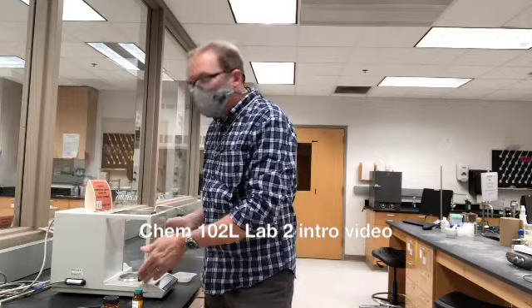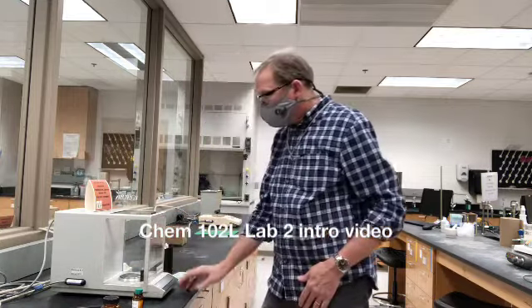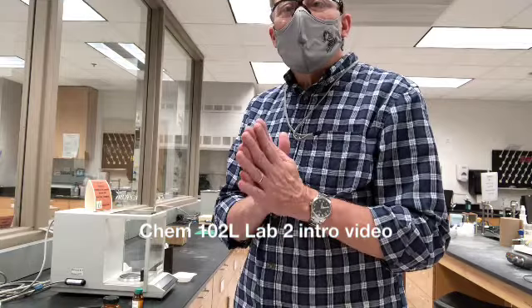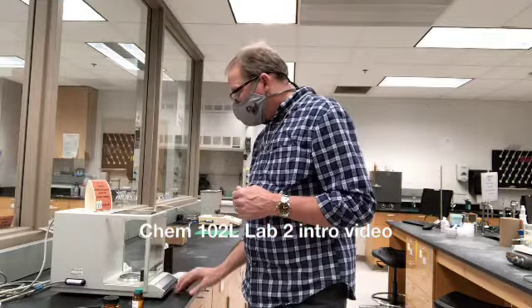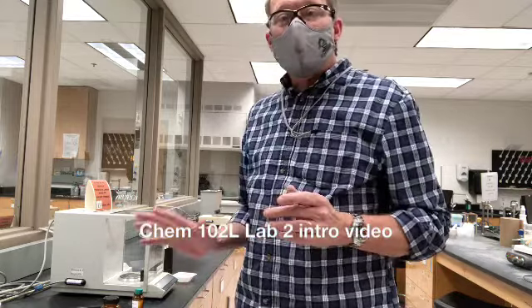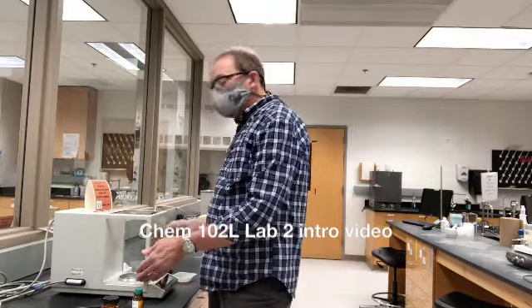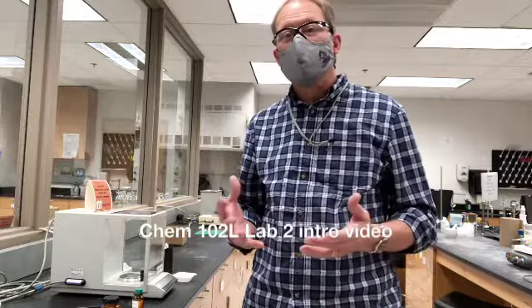It's the one with the doors on it. And when I read this scale that it displays for the mass, it's reading to the nearest tenth of a milligram. That is, in grams, it's got 4 decimal places to the right. And so it's very accurate and very precise. It has the doors so that there's no air currents to affect the measurement.